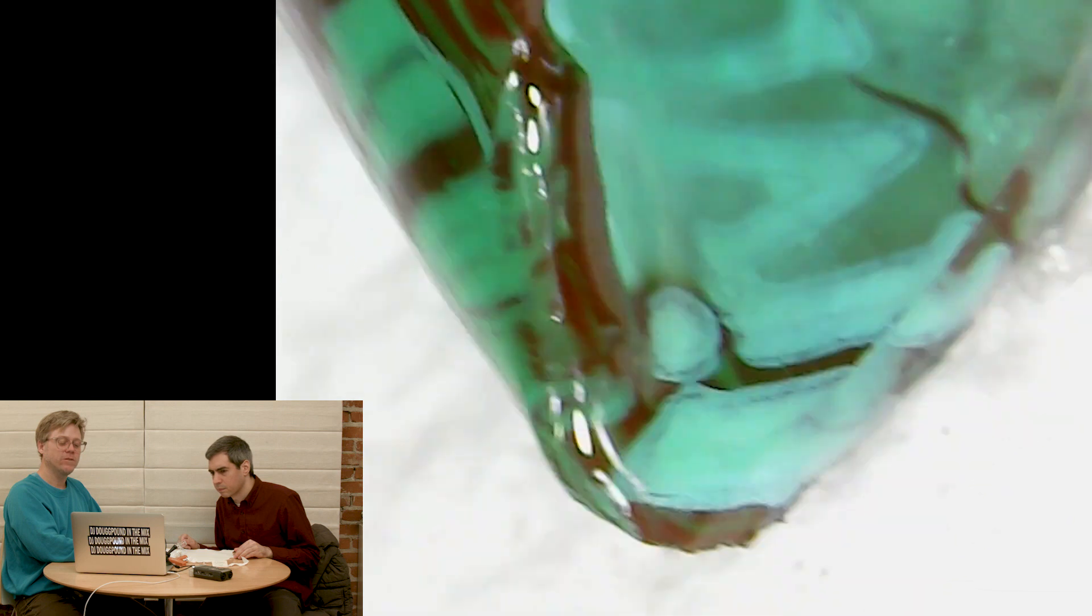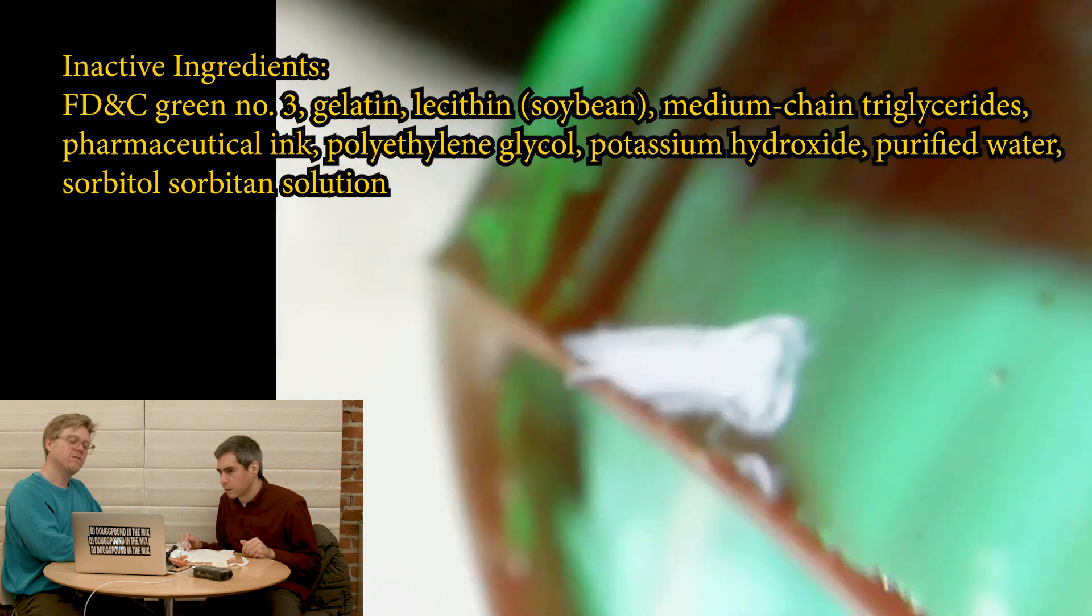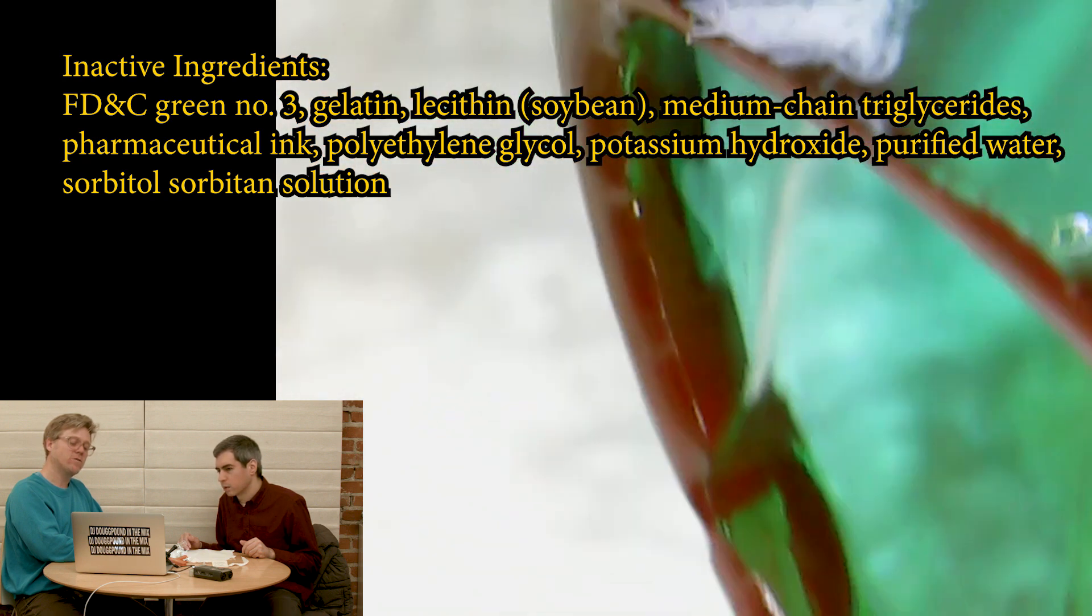And the... No, this is... The pharmaceutical giant is tricking you into thinking that it's green fluid, green magic fluid, but it's not. You know why? Green is clean. Yeah. It looks like plants or something. People like associate it with something, probably. They probably spent a billion dollars focus grouping it or something.